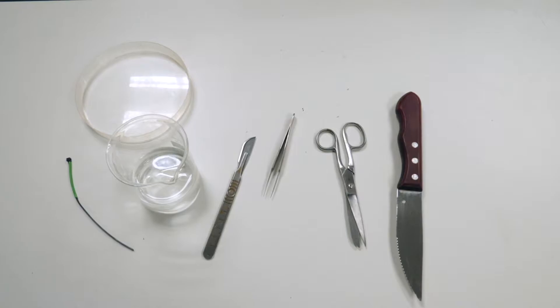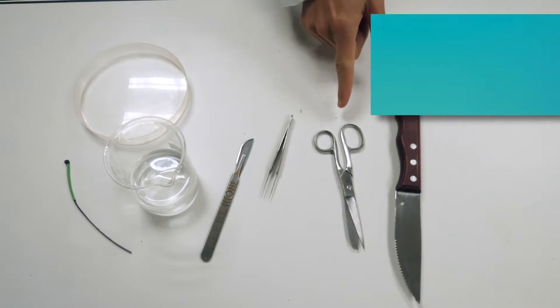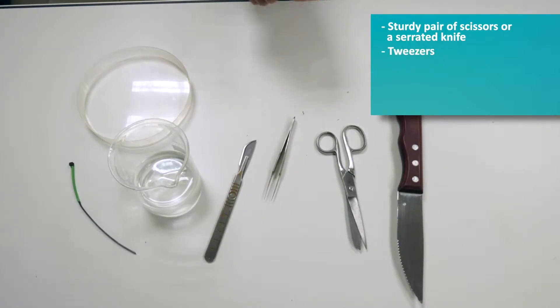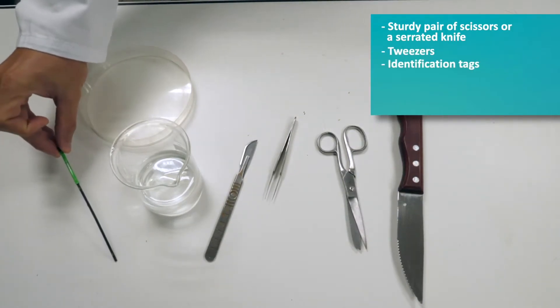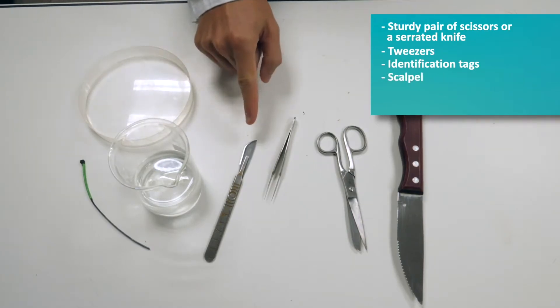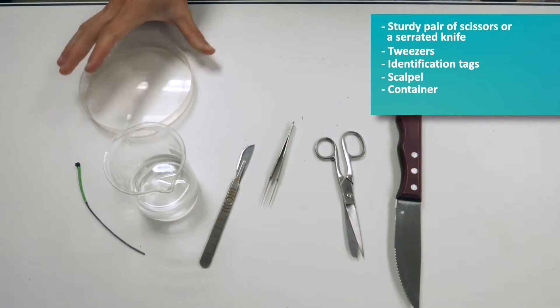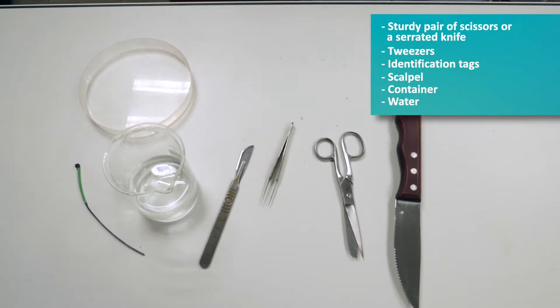To extract the gonads from a fish, you will need a sturdy pair of scissors or a serrated knife, tweezers, an identification tag, a scalpel, a container in which to place the gonads — this time we'll use a petri dish — and if possible, water.